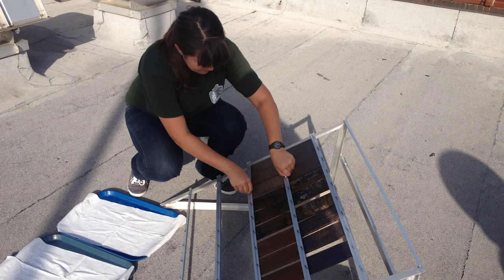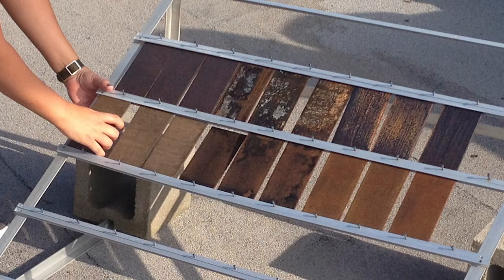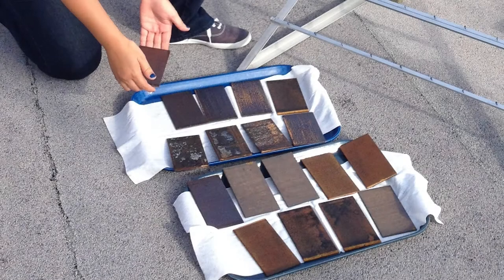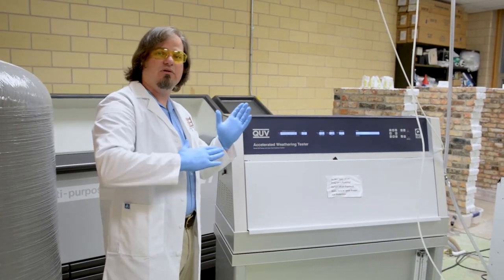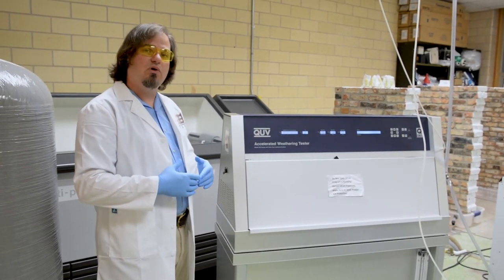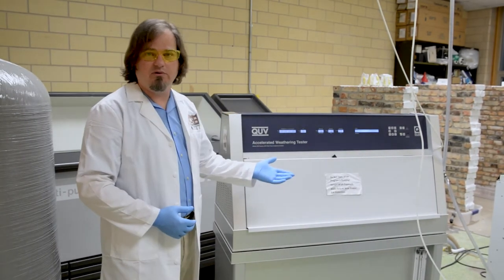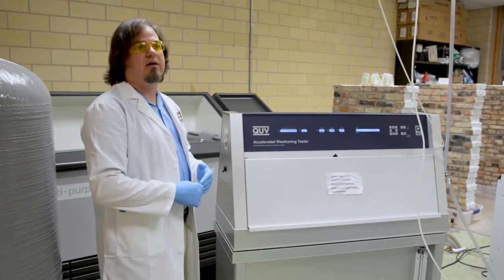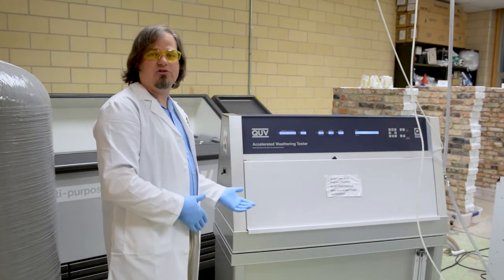Here in our indoor laboratory setting, we also have roof racks at Lee H. Nelson Hall that look at outdoor accelerated weathering. Those racks are on the roof, turned to the optimal angle of the sun. A lot of times we correlate both outdoor accelerated weathering with indoor accelerated weathering, and we can look at how a coating fades or how it changes over time.